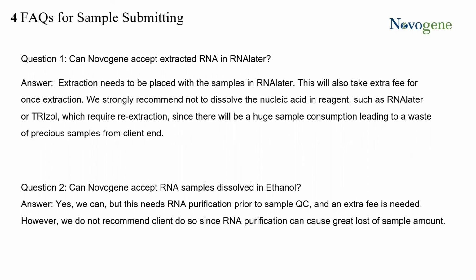Next question is, can Novogene accept RNA samples dissolved in ethanol? Yes, we do accept RNA in ethanol, but RNA needs to be reprecipitated and eluted back. So there will be extra fees to do this. However, we again do not recommend clients to do so, since RNA purification can cause great loss of the sample amount. Please check with the TS or the Novogene team what is the best way to submit your total RNA samples, in which form and which elution buffer, or what are the questions that you have.